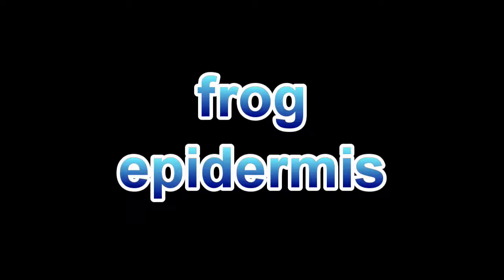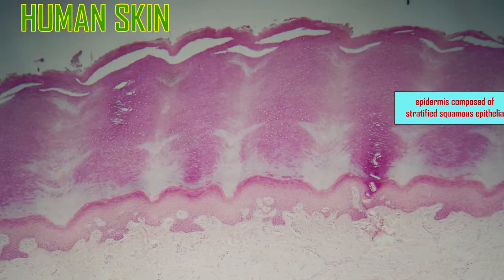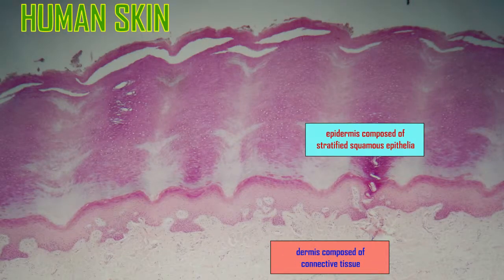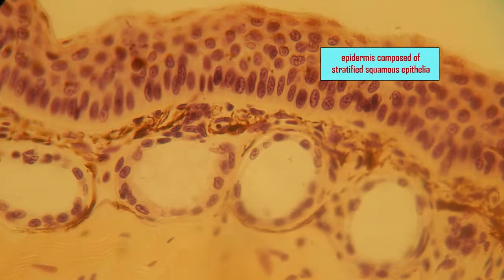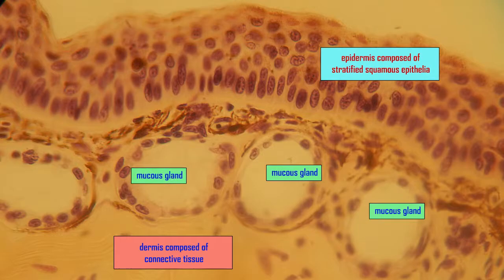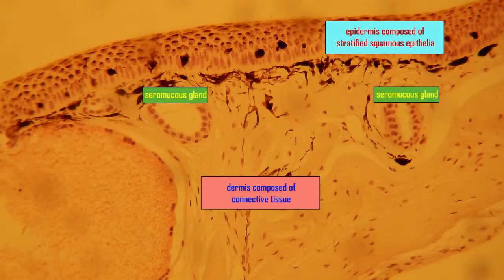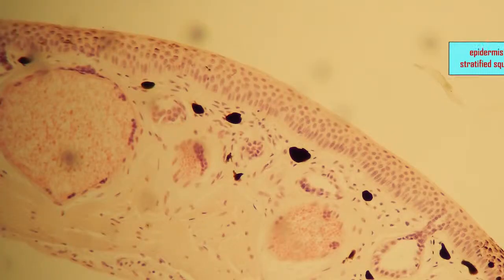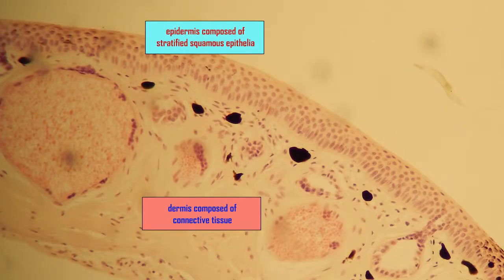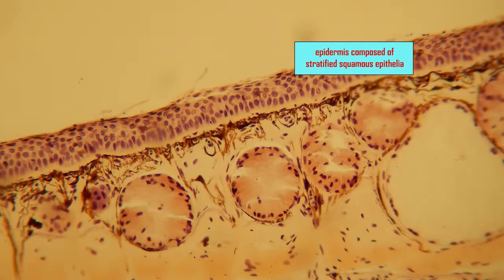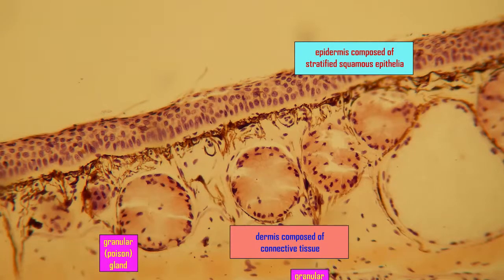The human integument consists of an epidermis composed of epithelia, a deeper dermis composed of connective tissue, and a variety of accessory structures, such as a variety of glands of epithelial origin. Some of these features evolved early in the history of vertebrates, as is evident in these microscopic images of frog skin, which also is composed of an epidermis composed of epithelia, a deeper dermis composed of connective tissue, and is associated with a variety of glands of epithelial origin.